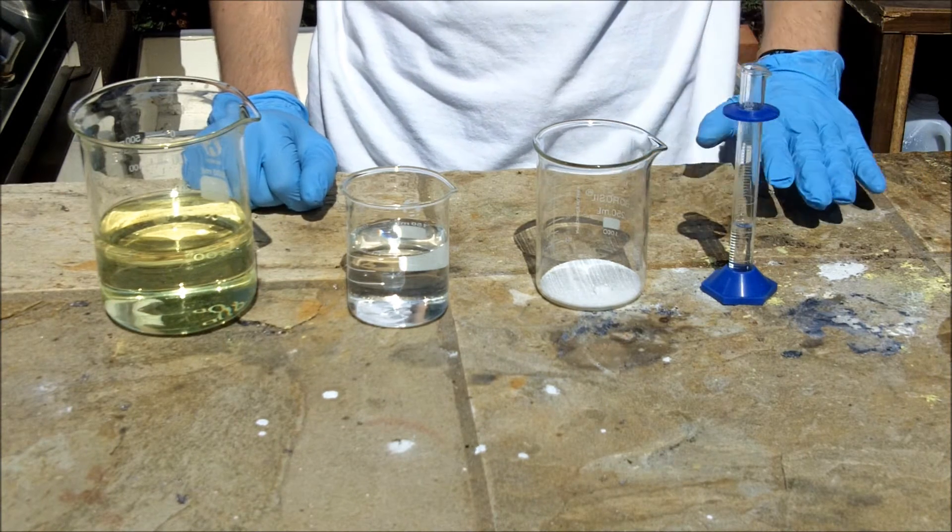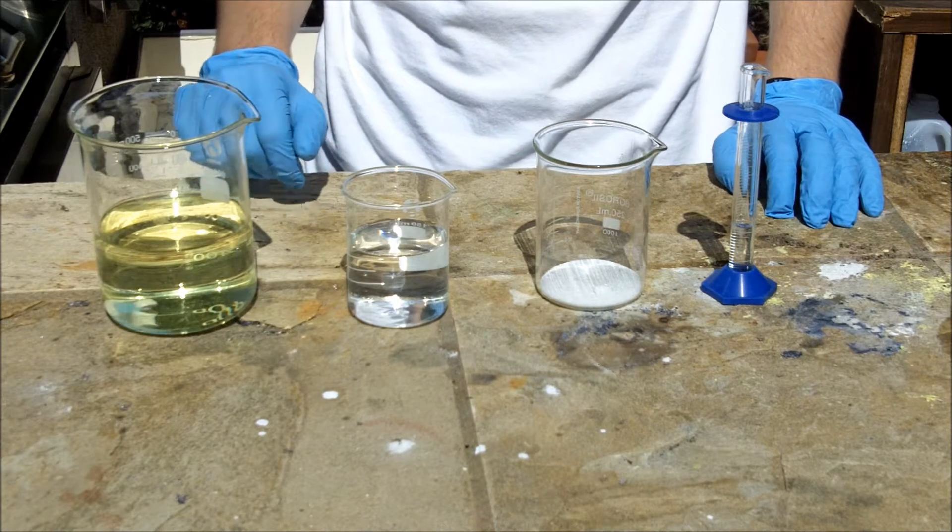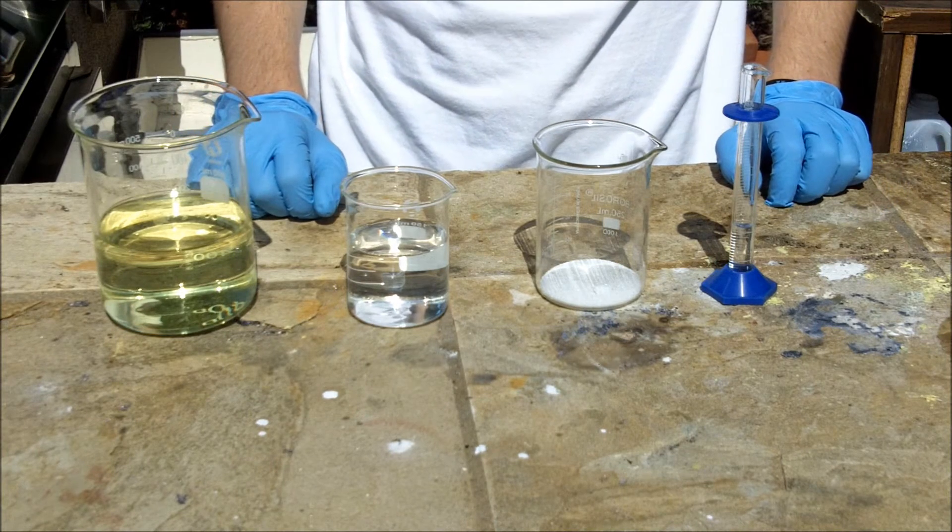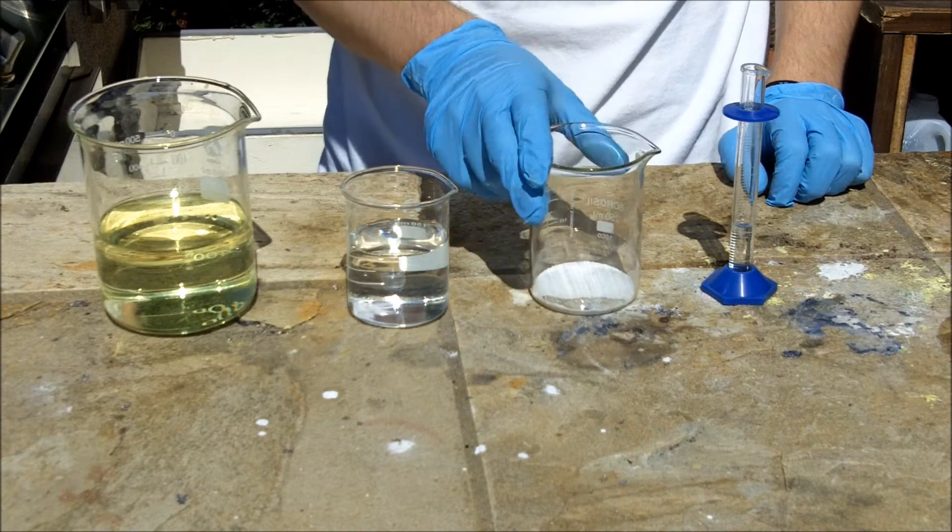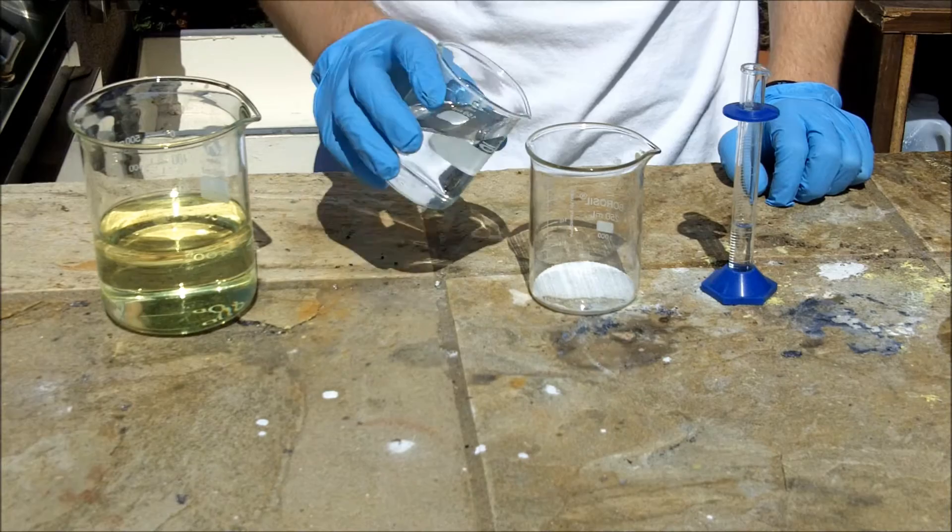So I am not going to be making fluoroform though because I don't have any fluoride salts. Anyway, so to get started, take 7.4 grams of sodium bromide and dissolve that in 100 milliliters of water.